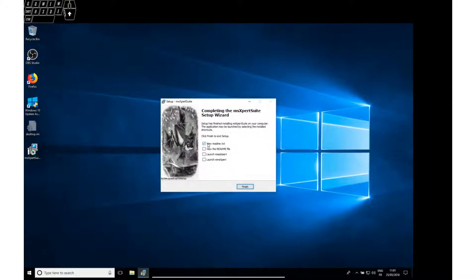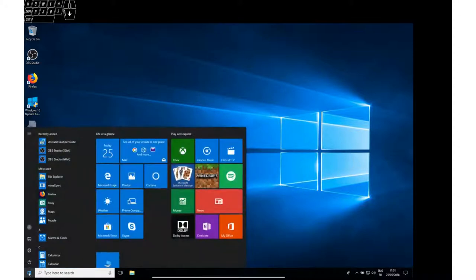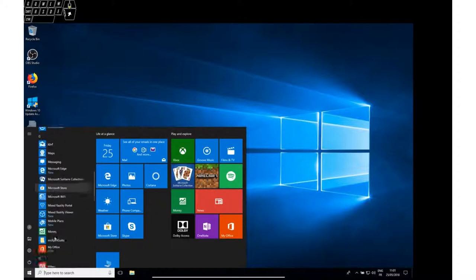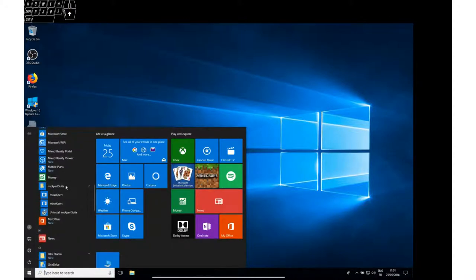Uncheck these. Finish the install process. At this point, the program should be installed in the MS Expert Suite directory, which contains two binaries.